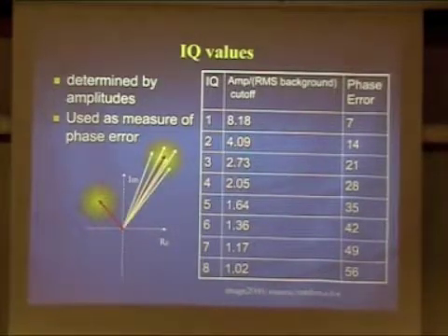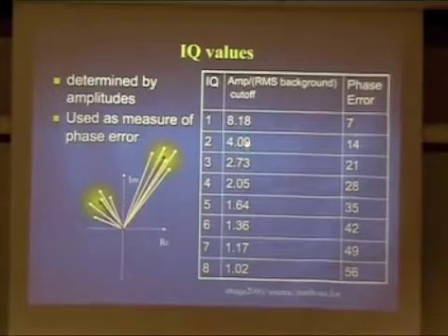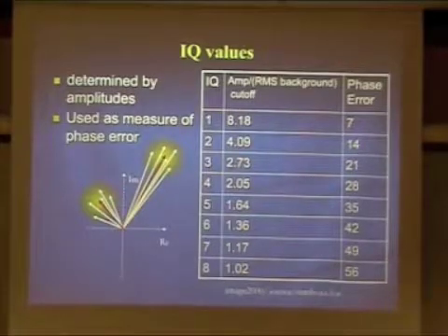If you look at the phase distribution, the phase is defined by whatever that angle is. So the range of the phase in this distribution of a high amplitude peak would have a very narrow distribution. However, if that's a shorter vector, a weaker reflection, then the range will be larger. So you can basically relate your amplitude values to a phase error that you will from now on use as your determining factor.